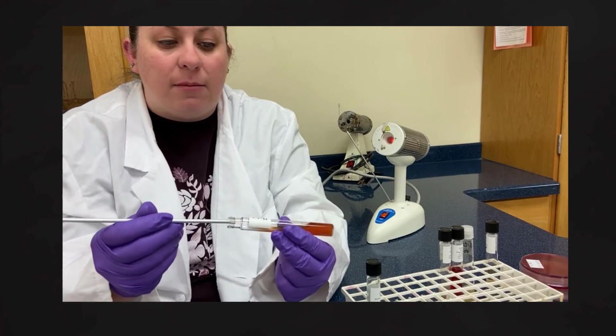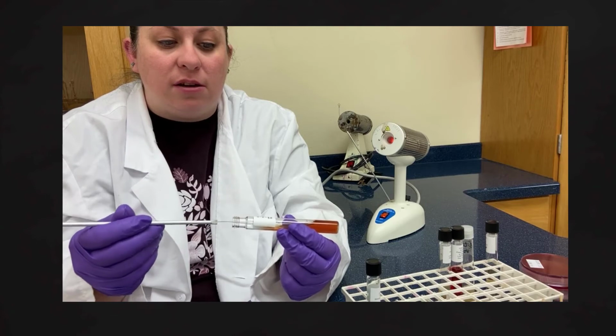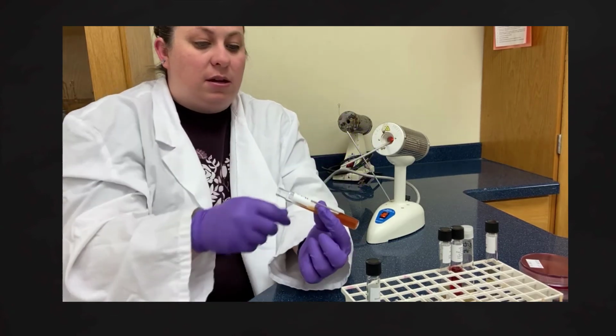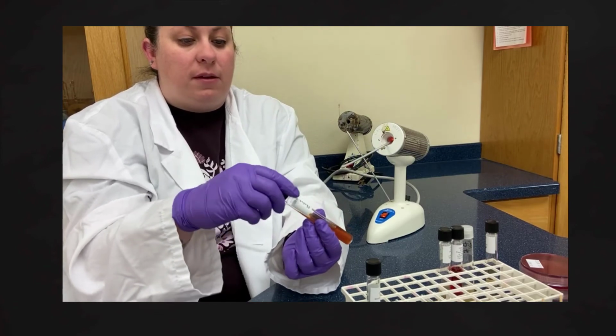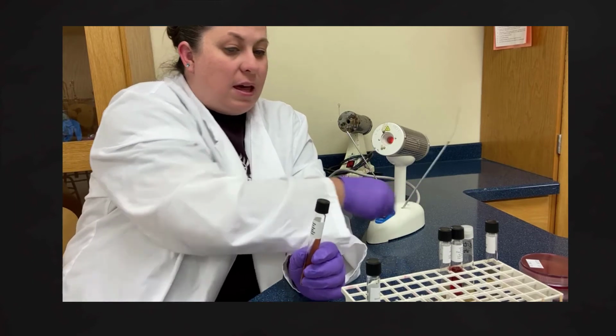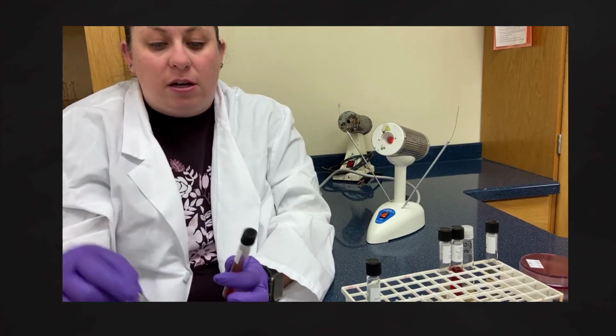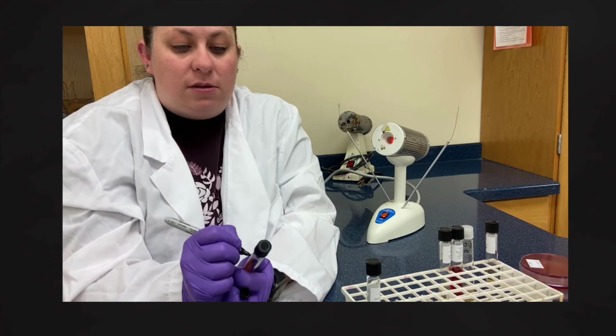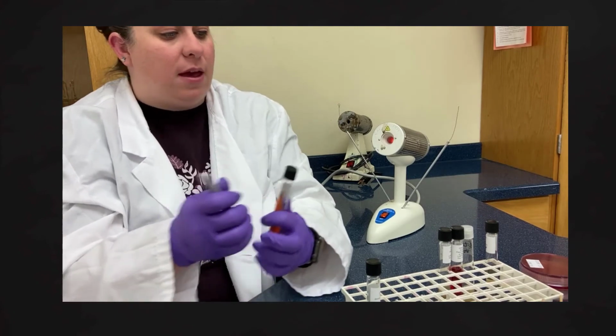Then I'm going to come back and scratch the surface, okay, as I come up. And then I'm going to sterilize my needle. Again, lid on, half a turn, and my initials and what I have, okay?